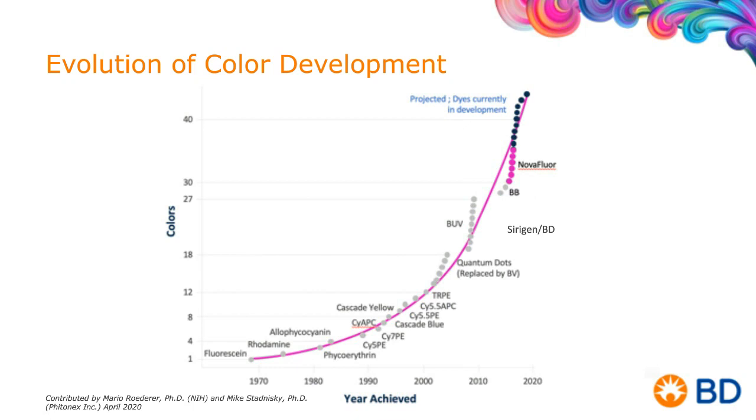And many of them are actually new, with new filter sets that are needed. So it's a combination of taking older technology sometimes and refiltering versus moving into new technologies that you can do everything with. And that's a challenge for all of us, but just because of the age of a flow cytometer in your lab, it doesn't mean you can't use these great new dyes and conjugates that are being created today.